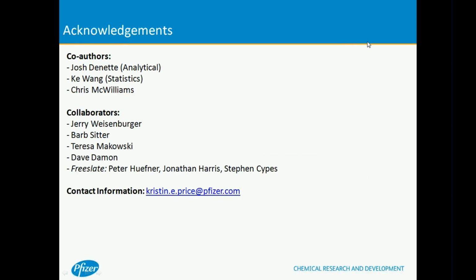And we've been brainstorming as to potential options for PAT, so perhaps Raman analysis of the vials. We've also been looking at direct injection onto mass spec, ways to make the flow paths shorter, parallel HPLC. We've been brainstorming with a number of analytical chemists on this, and so we hope to continue to develop it and make it faster.